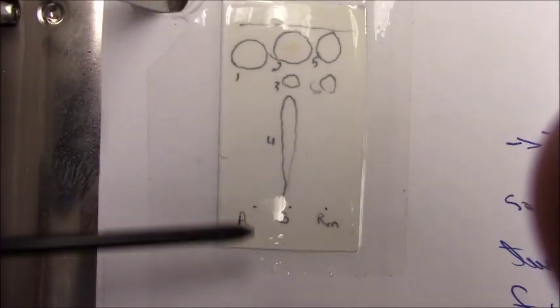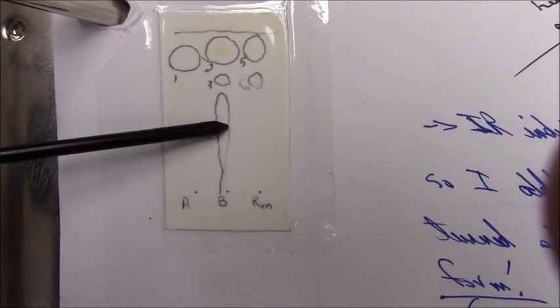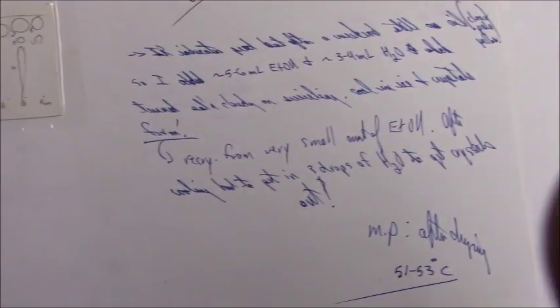Just a quick look at even the TLC. Depending on what solvent you run it in, it might not run quite this fast, but benzaldehyde normally has this lower strip or item, and that is benzoic acid. That's benzaldehyde, acetophenone, and then the reaction ends up having a couple of spots. Leftover benzaldehyde is what it looks like. A lot of people have, in 10-to-1, it runs a bit, these spots are lower down, that's normal. So that's the reaction. So we're going to look at the results.